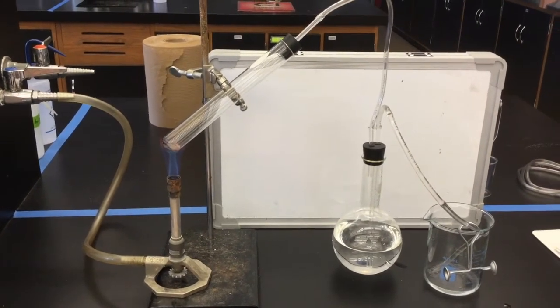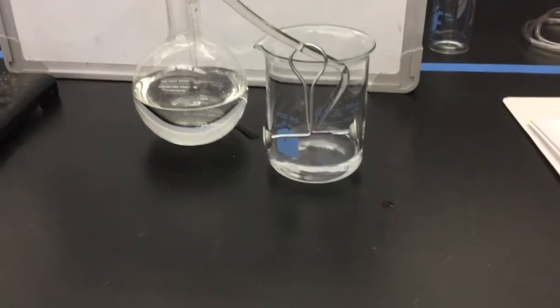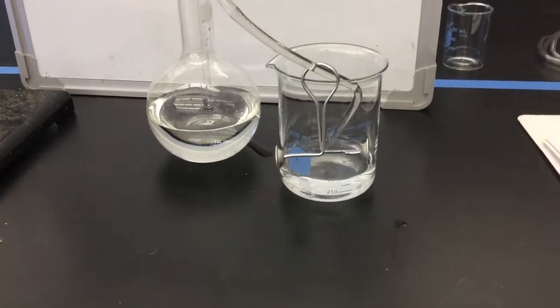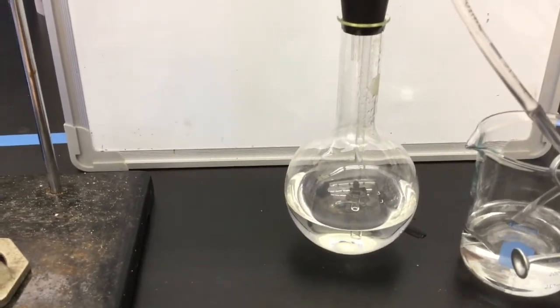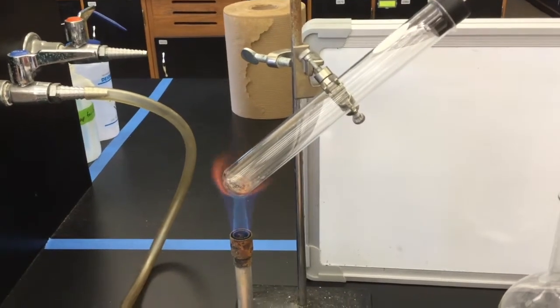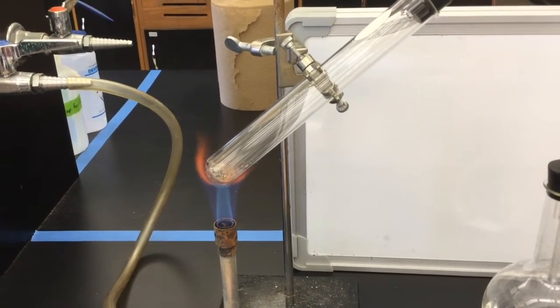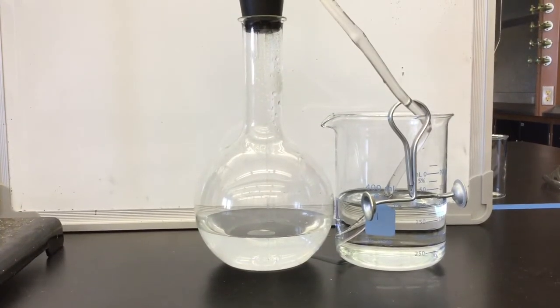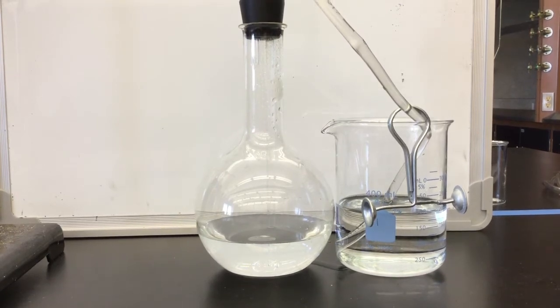Once you put the Bunsen burner underneath the test tube, you should notice that the system will begin working right away. You'll see water start collecting into the beaker, and this is coming from the water that's being pushed out of the Florence flask because of gas that is coming from the chemical reaction. We're going to continue with this reaction until no more water enters into the beaker. Once the water level stops rising, turn off the Bunsen burner and allow the reaction to come to room temperature.